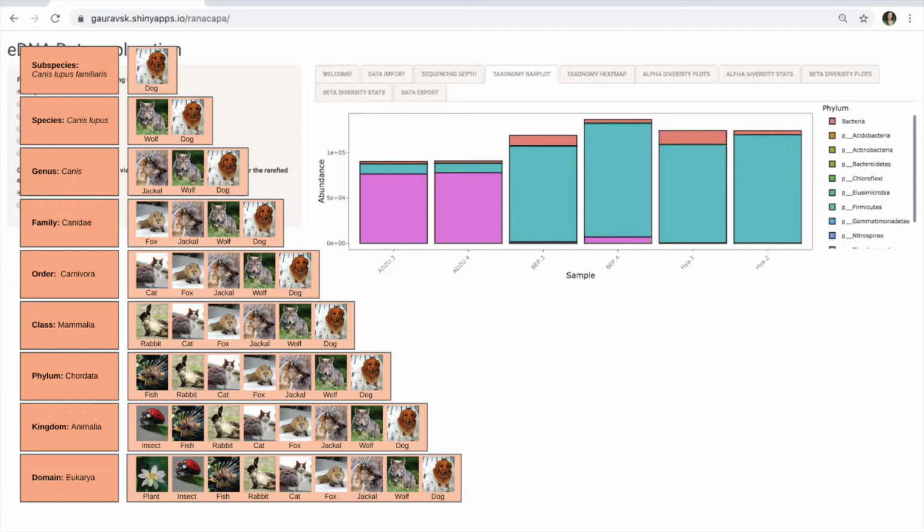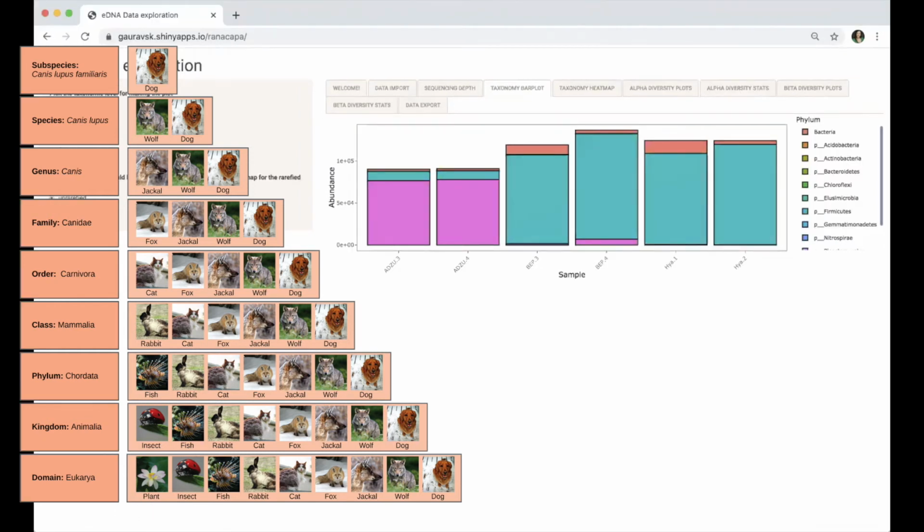And then that's how we get that kind of grouping or similarity and classification of different organisms. So for example, if we were to sequence dog DNA, we could then make a classification like this, where we could group it based on other things that it's genetically related to. And the way that we group them can be at different levels. So the furthest, most distantly related would be at the domain level.